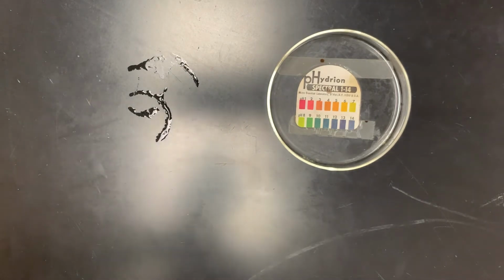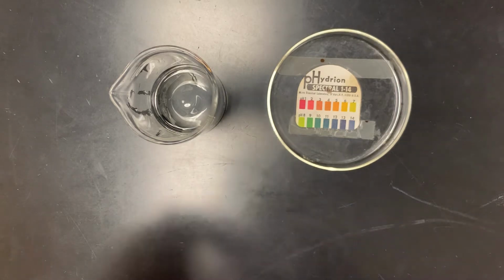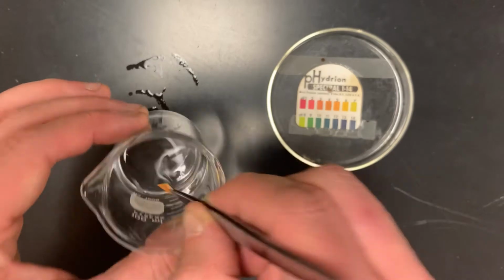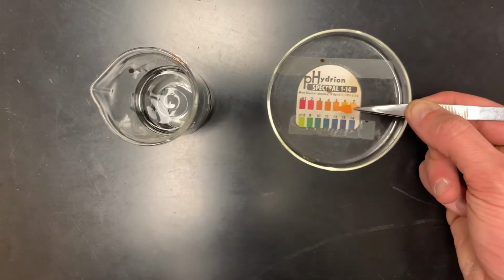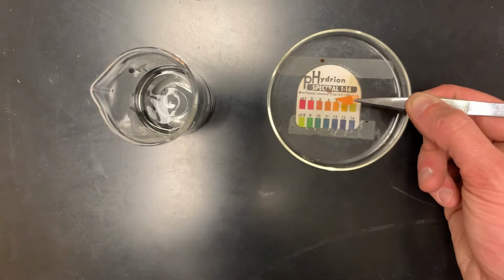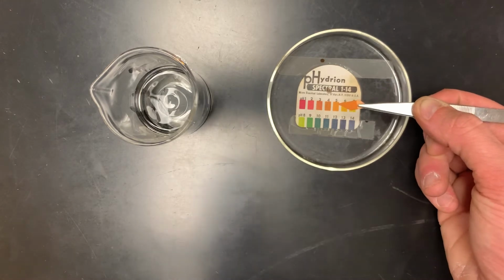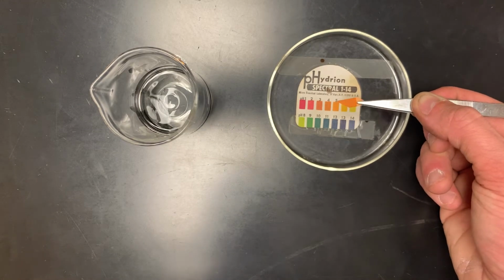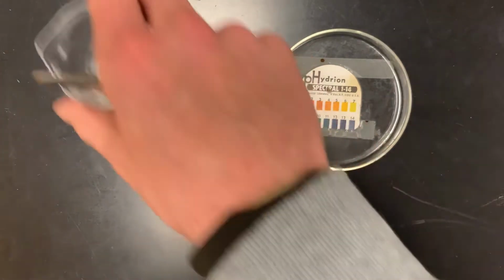I push on to sodium nitrate. We should know from our solubility rules that both sodium and nitrate are soluble with pretty much everything. And when I say pretty much, I mean everything. So it'll be interesting to see what happens here. Okay. Now again, we can talk about this a couple ways. We could say that it's maybe a pH between 5 and 6, which again, recall that that's what our baseline, our control of just our distilled, ungassed water, looked like. Keep that in mind for sodium nitrate.